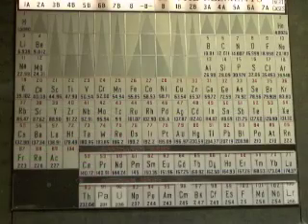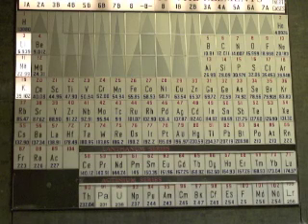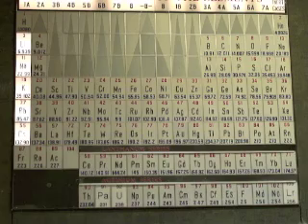We saw that all three of the alkali metals tested reacted with water to produce hydrogen gas and form a basic solution. As we go down the group of alkali metals from lithium to sodium to potassium, did the relative rate of the reaction increase, decrease, or remain unchanged? What would you predict would happen if rubidium were added to water? Cesium or francium?